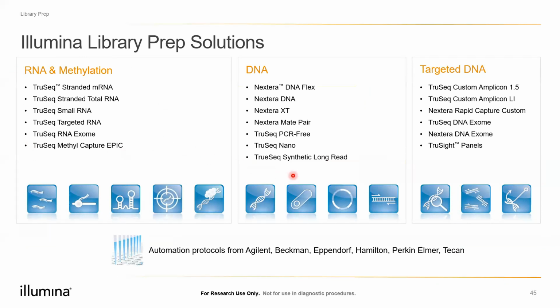So certain kits are listed here. Some of them can be clinical also. Some are normal, like a whole genome library kit, which will be just for sequencing your DNA. So basically, you can have DNA from any source, any sample.